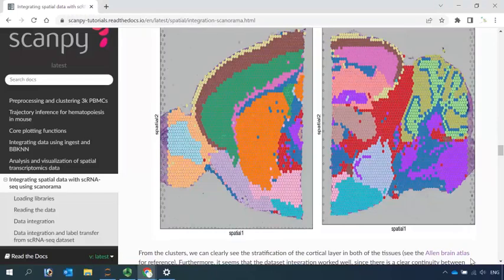Hello everyone, welcome back to my video tutorial for single-cell RNA sequencing data analysis. Today I'm going to show you how to integrate spatial sequencing datasets.